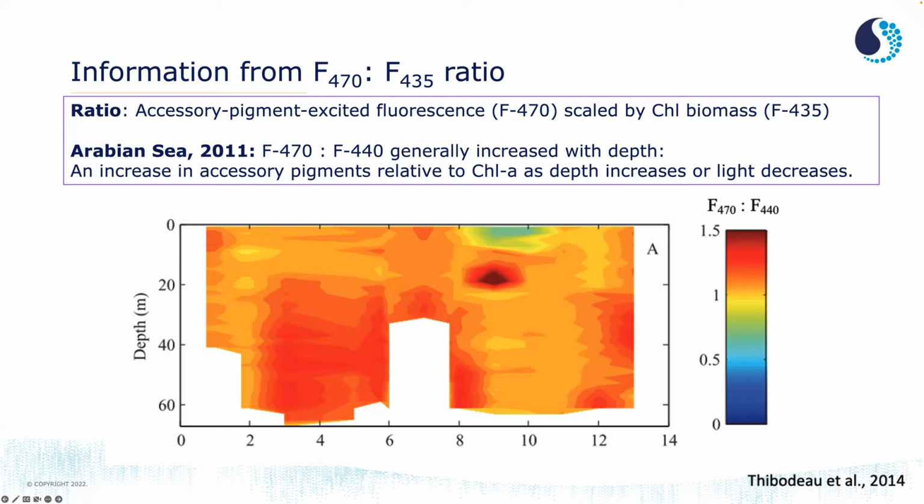So for example, we have a hyperspectral absorption and attenuation meter that used to have an incandescent lamp. We've replaced that with a white LED that gets about 10,000 hours of lifetime as opposed to less than 4,000. That means fewer trips back to the office or back to service. And it turns out that white LED has a little bit better signal to noise ratio in the blue, a little bit more oomph in the blue, which means the error bars on our absorption and attenuation measurements in the blue are smaller than they used to be. So whether it's the particular design of our instruments, the configuration of them with respect to the measurements, or the calibration of those instruments, we're constantly trying to improve all of those.